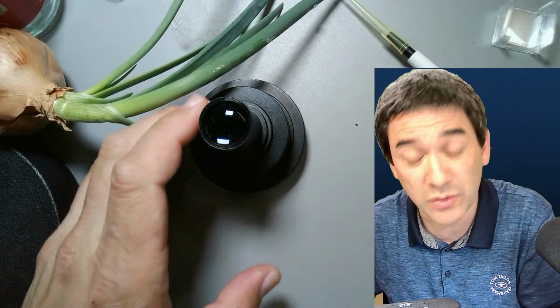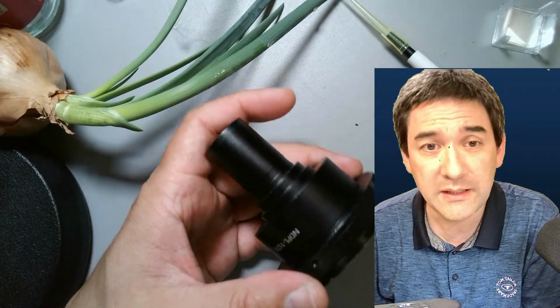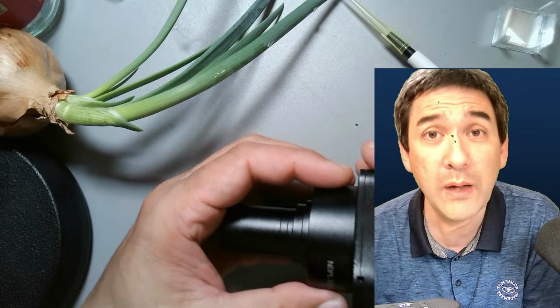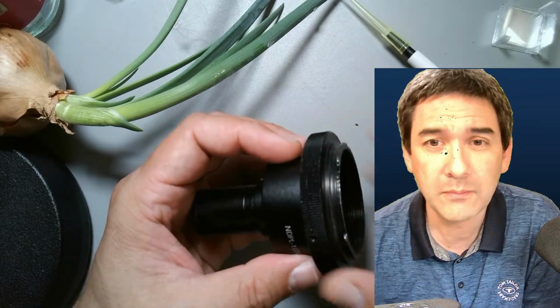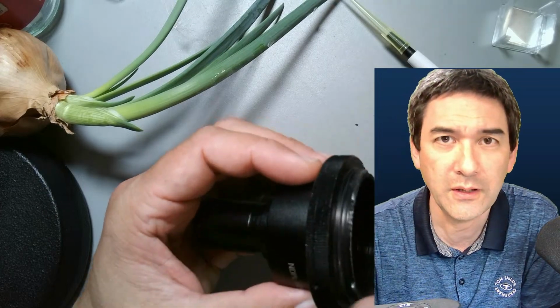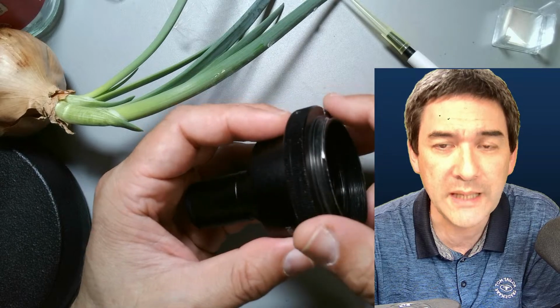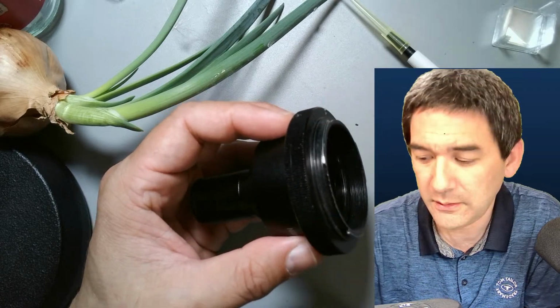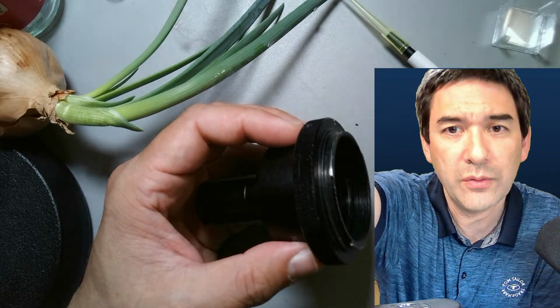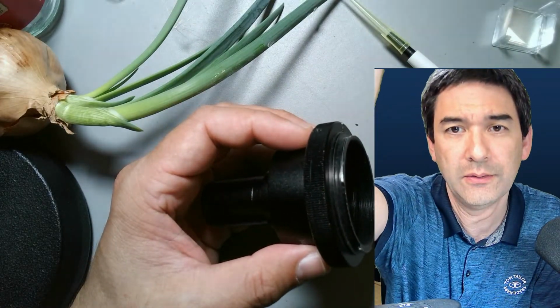You're probably going to say, wow, that's expensive because the D90 camera is so expensive. So there is, of course, a cheaper version over here, and that's if you have a microscope. Look at my face a little bit. Sometimes there are these dots in my face. That's because of the filter that I'm using. What you can also do is get yourself those adapters here. I'm going to try to change the brightness a little bit here.